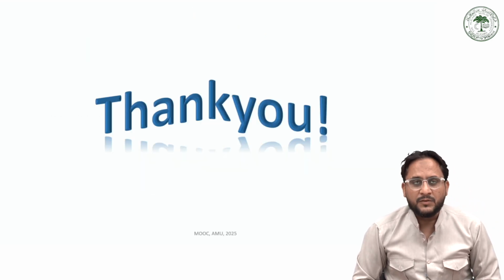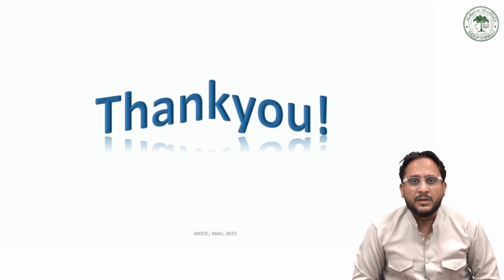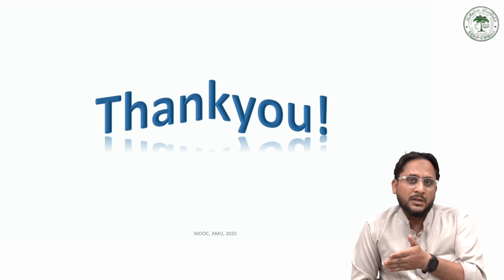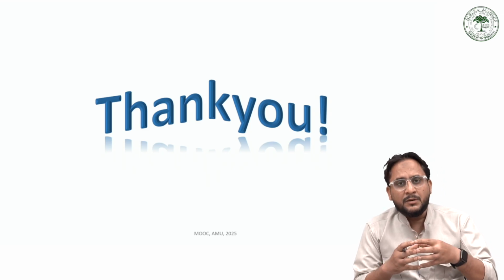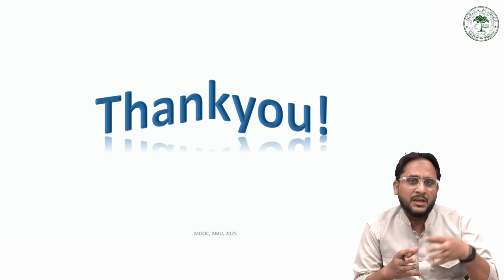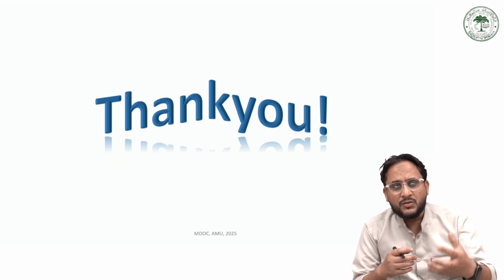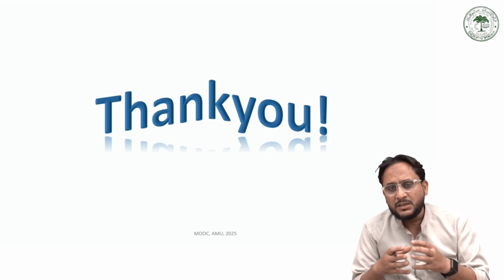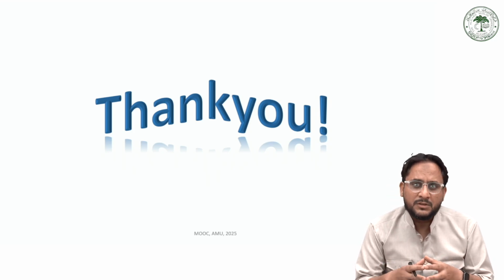Thank you very much. So we have completed the instrumentation of molecular fluorescence spectroscopy. In the next lecture, I will explain how these measurements are carried out, how we prepare the sample for fluorescence analysis, how the spectra are generated, how studies can be carried out, and what specific compounds are studied by molecular fluorescence spectroscopy.